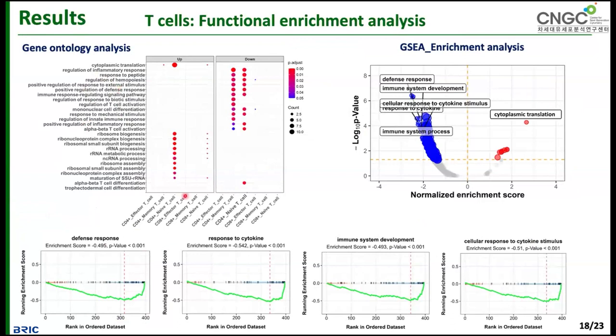We can confirm this in all individual cell types. And similar to the other two, we got the same result, and there will be no hyperinflammatory immune response when we are treating the cells with nanomaterial. This is the supporting data for this result of the gene enrichment analysis.